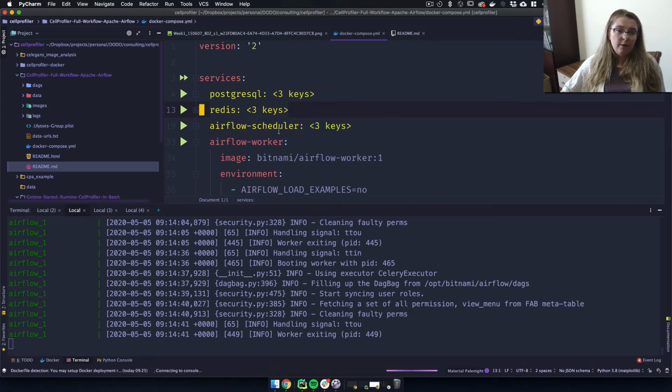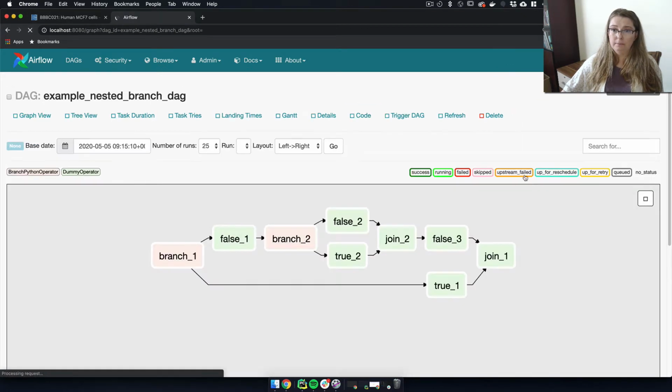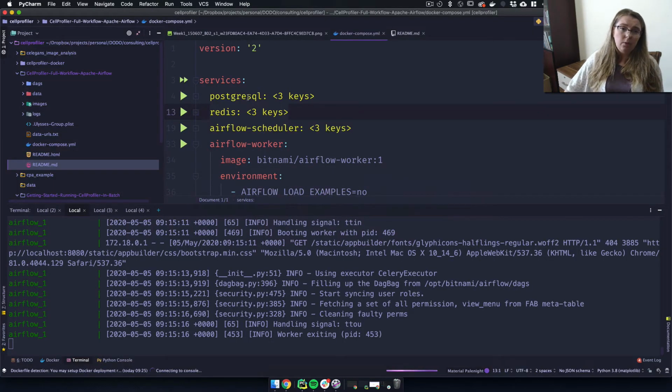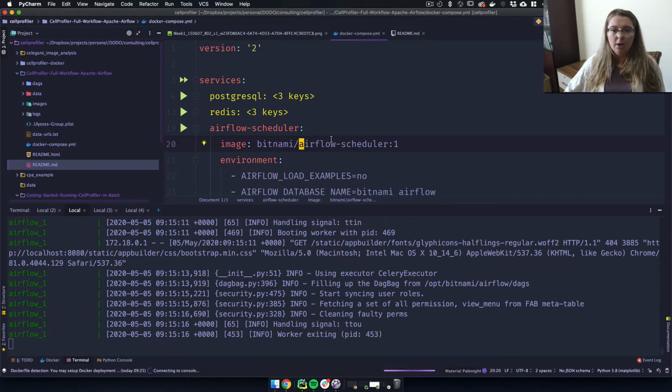One of the things that Airflow does is, because it keeps track of all this information about the state and the kind of analysis, and you also get logging and timestamps and when it was executed, all this kind of stuff, it needs a database backend. So you have that in here. You have Redis. That's for real-time communication. I don't want to get too much into that. That's getting a little bit too techy. Just know that it's there.